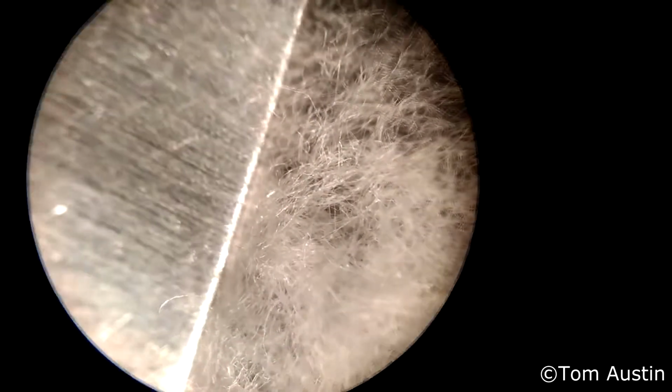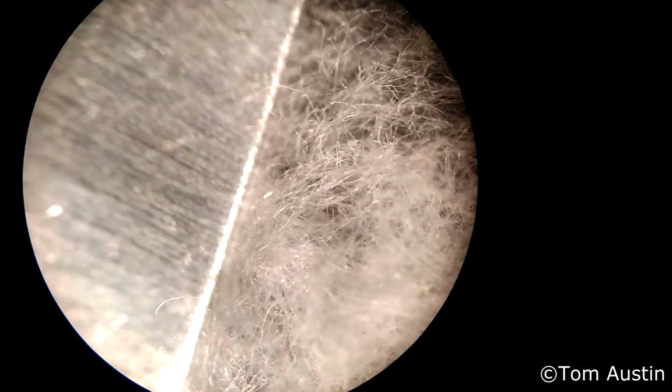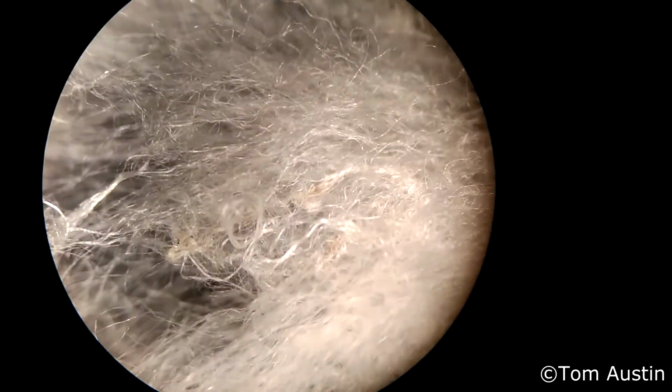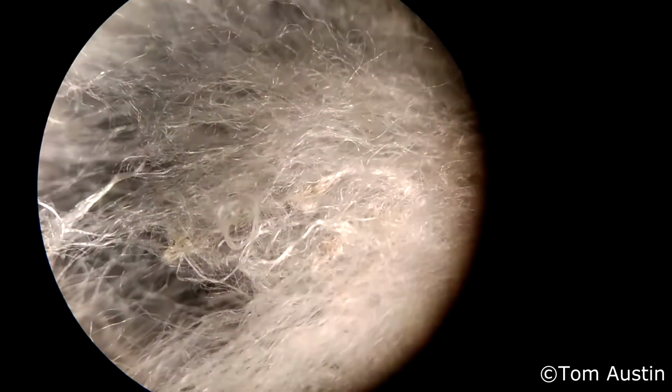Notice that the fibers are mostly uniform in thickness the whole way down. That's another good quality to note. Here's some of the larger fiber bundles closer to the seed coat. They all just sort of stick together in one lump of threads until you fluff it out like I've done.